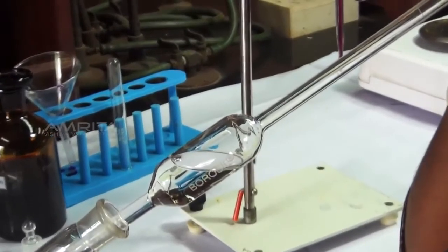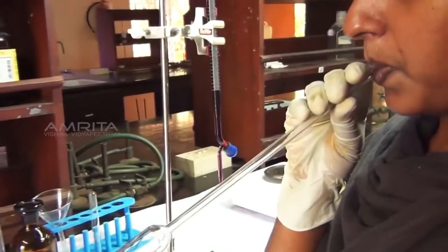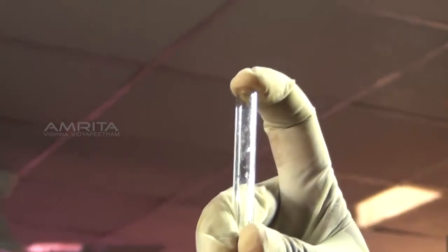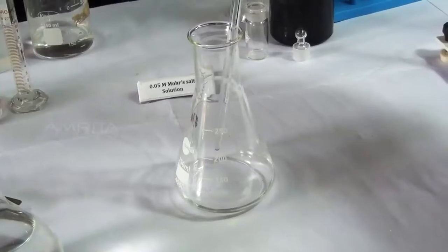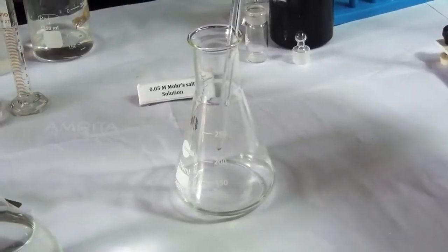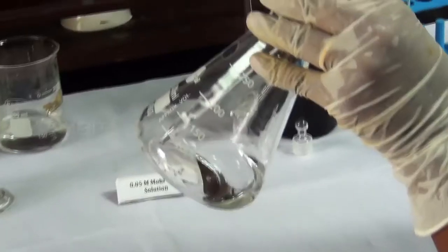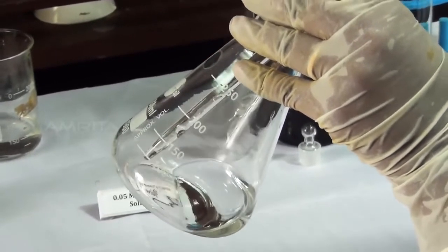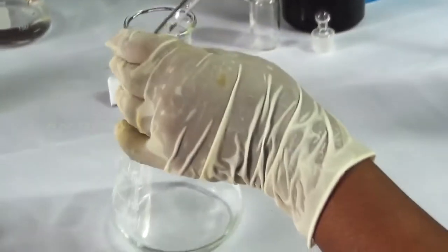To do this, first pipette out the solution until the level is just above the calibration mark, then close the upper end of the pipette with the index finger and slowly release the finger, bringing the level of the solution lower. Transfer the Mohr salt solution into the clean conical flask and touch the tip of the pipette to the bottom of the conical flask to transfer the remaining solution.